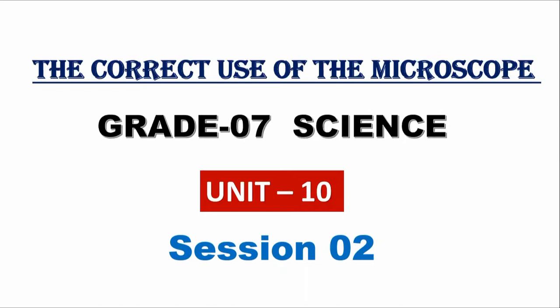So today in this video, we'll be talking further about the parts of the compound microscope and their uses and how you could use the compound microscope. And then finally, we'll be talking about the electron microscope. So let's get into our lesson.